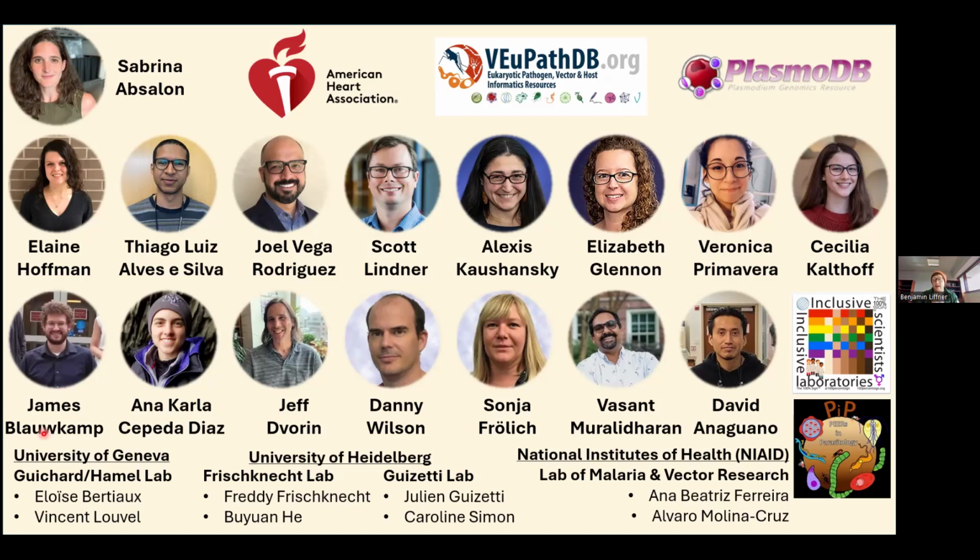So the particular consideration with blood stage parasites is that they end up with a bit of a void space in the middle where the hemozoin crystal used to be. It seems as if the digestive vacuole, the structure in which it's encased, is preserved, the membrane is preserved. However, in the middle, you just have space that has nothing. One consideration is that off-target labeling for antibodies often goes to the void food vacuole space. But no, I don't think hemozoin can expand. I think there are ways to digest it, in which case you may get it to expand, but certainly in its native state, it doesn't.